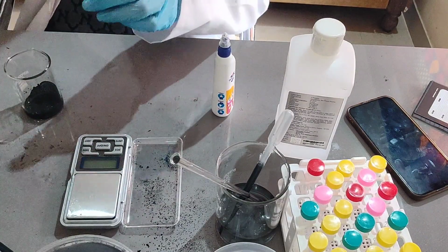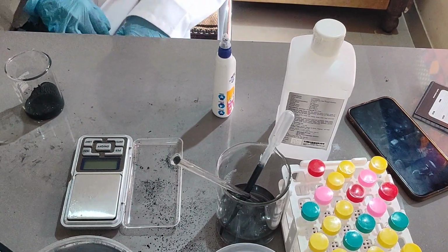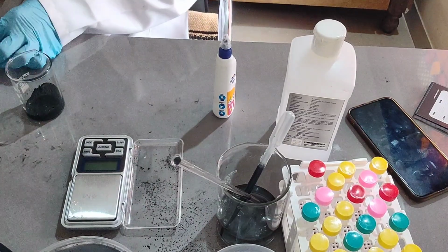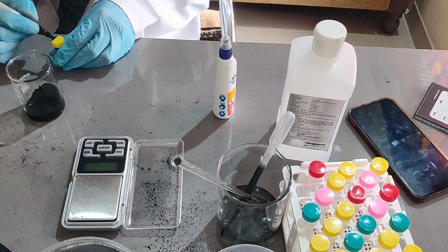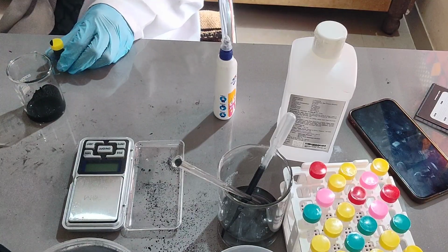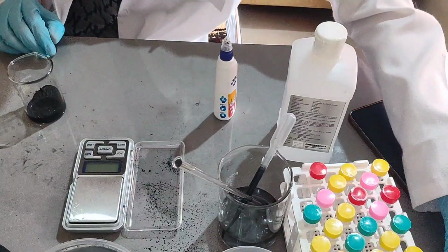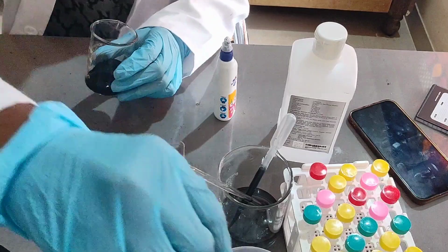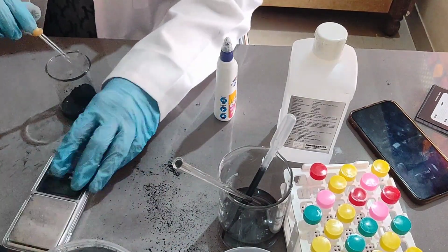Okay. The first sample is created. Let's mark it. We don't have to put the red circle on top of these ones. Only the black mark to signify what experiment this is. Okay. There's that. Clean this. Reverse this.